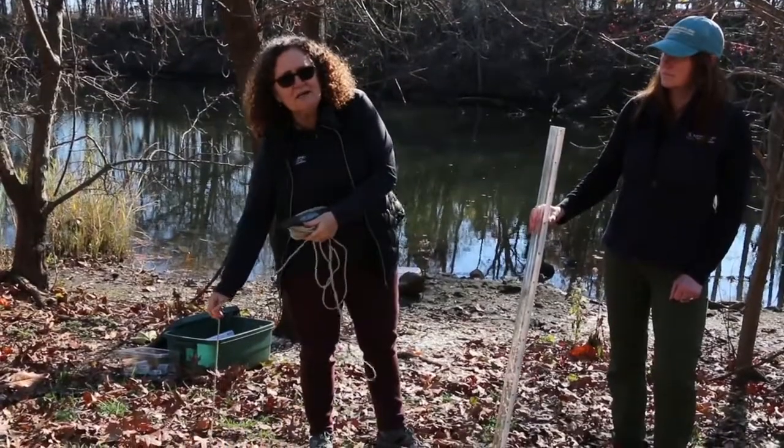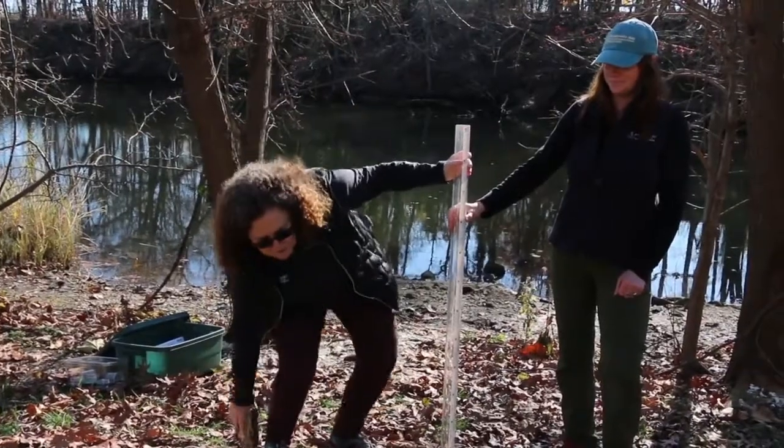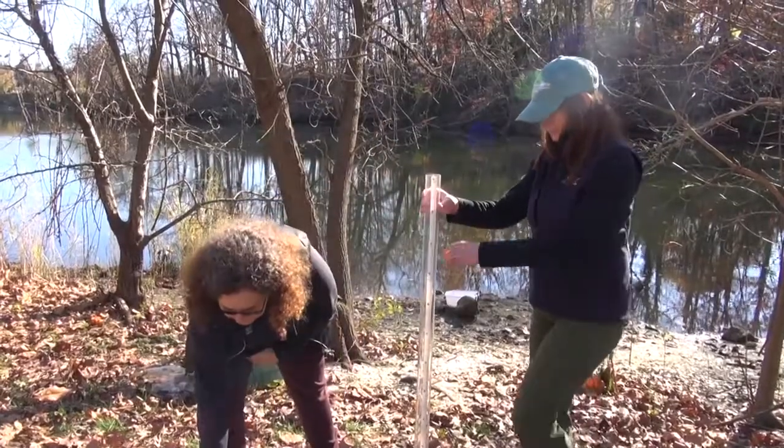Since we're in a shallow body of water today we're going to use what's called a Secchi tube. It's basically a narrow tube, measured the same way with meters. We'll pour the water into the tube.